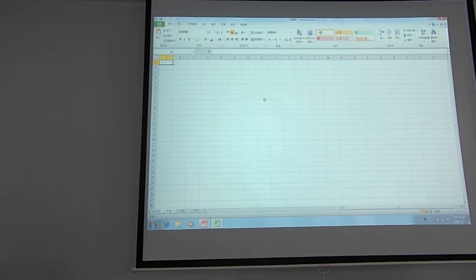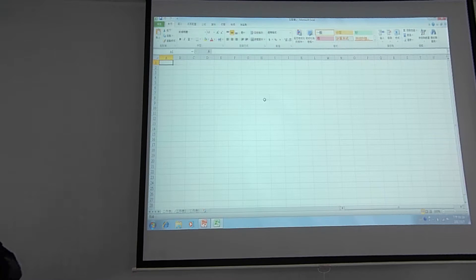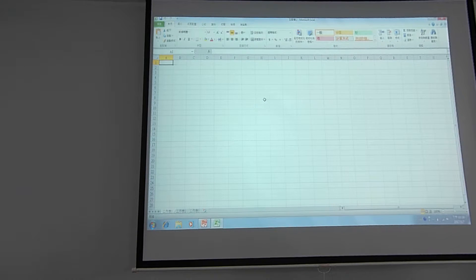Please open your Excel program on your computer and navigate to this page. The difference between this example and the assignment is that this crystal structure is FCC.